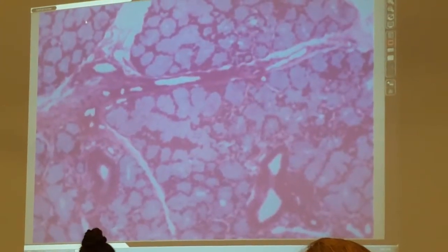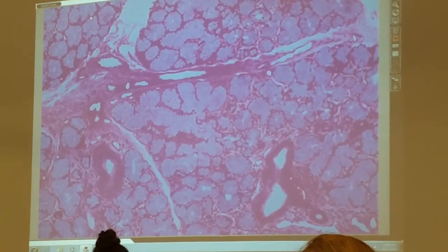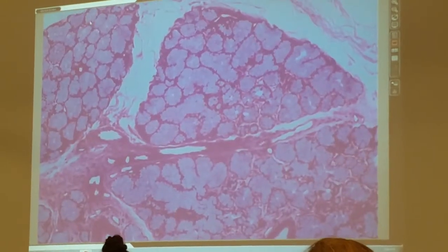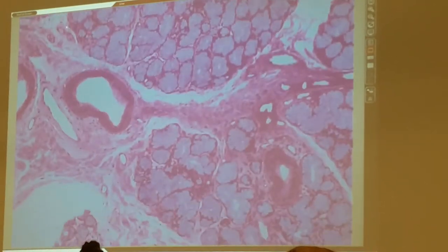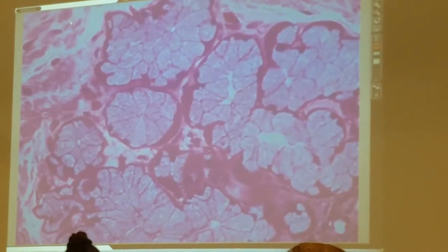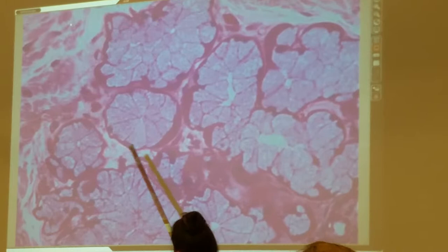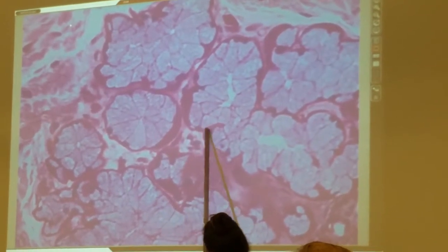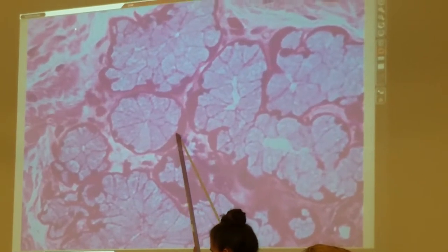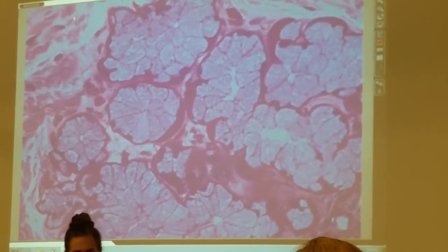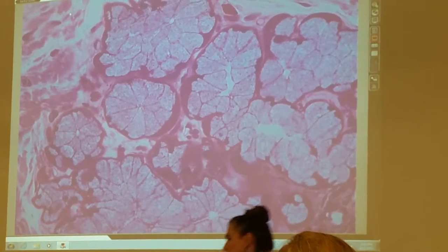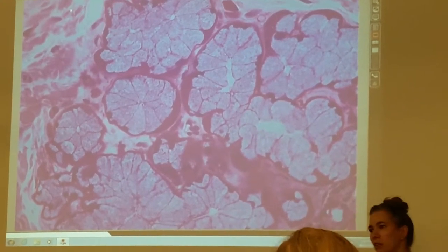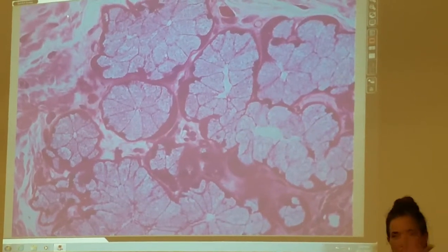Notice the transition here — we have more of that other material. What gland am I looking at now? I'm looking at the sub-what? Sublingual. So here's the sublingual gland. If we look up close here, what is this material that you see that is very pale? This is a mucous acinus. In a couple of places, we push out those other cells and they kind of make these nice little caps on the end. What would we call those little caps? That's a serous demilune. So on the higher power you can see the serous demilunes, and one thing you should be able to see is that there's quite a bit of mucous acini.